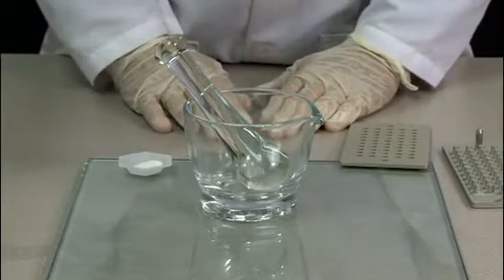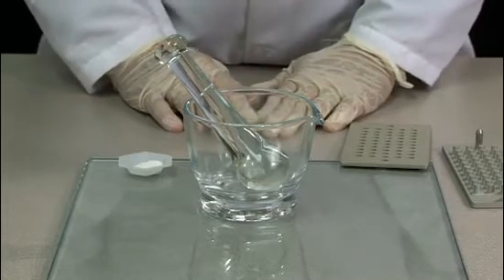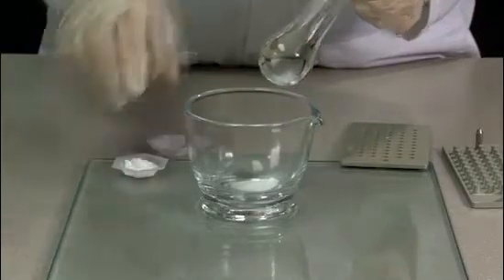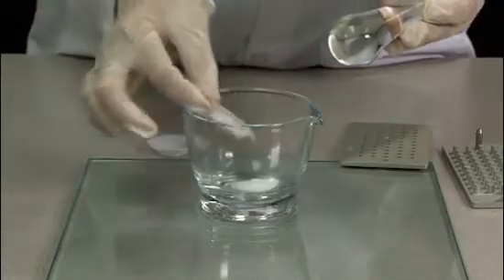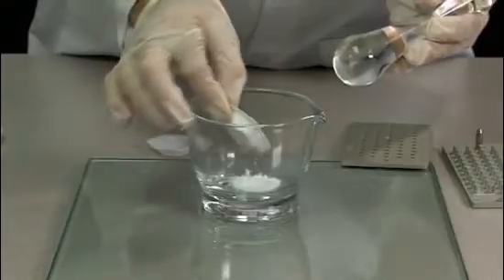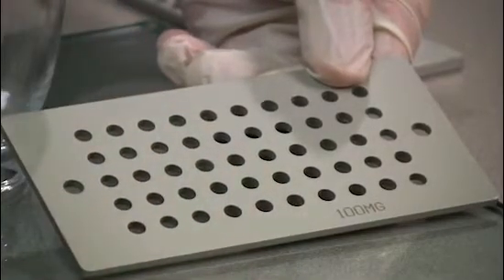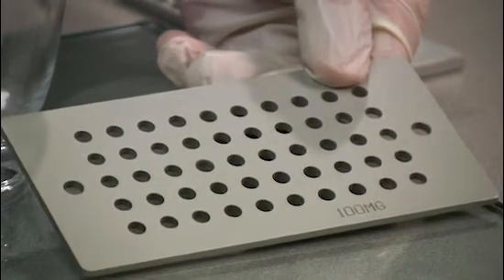The percentages that are used in any particular tablet are experimentally determined. For these tablets, 40% sucrose provided the desired hardness of tablets. Metoprolol is added so that we have 12.5 milligrams in each tablet, and then the remainder is lactose to make up for the amount of material that the mold will hold. This is a 100 milligram tablet mold, and there are 50 cavities in the cavity plate. Therefore, 5,000 milligrams is the amount of material that can be held by this mold.